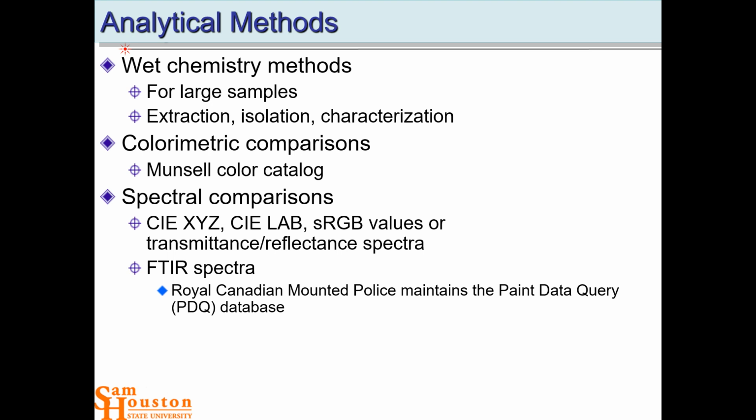And then sometimes going to a different spectral region, like FTIR, is necessary. And if you can image in the FTIR, which we can upstairs in my lab, that's even better. It's very time consuming because you have to take a pixel at a time. And so you have to run through and take a spectrum in a grid and then look at that. That's called hyperspectral imaging. So you've taken an image and every pixel is a spectrum.